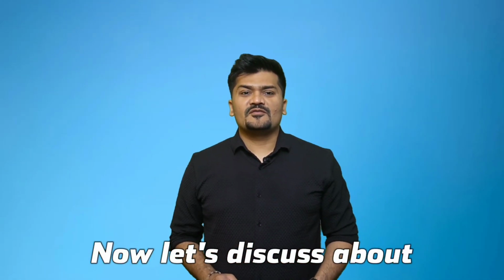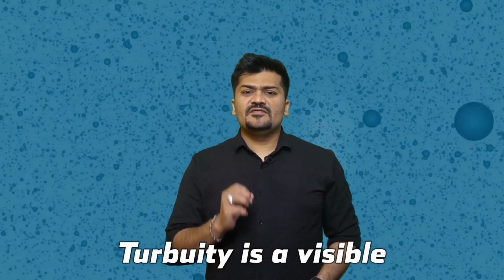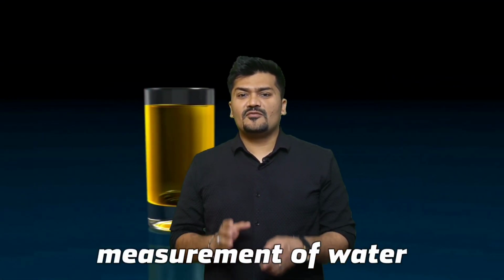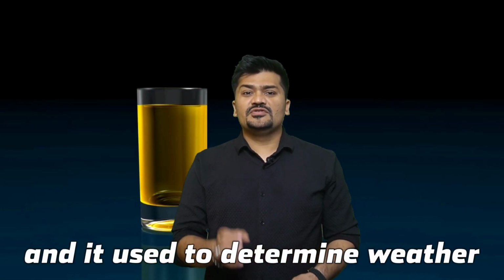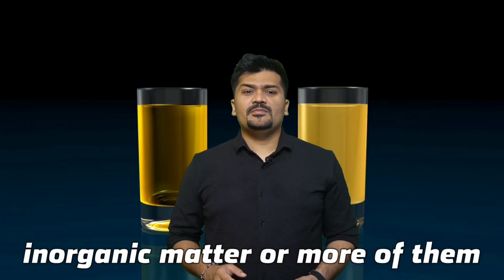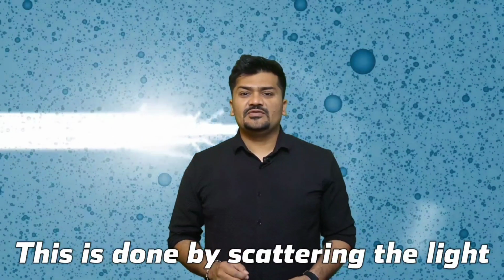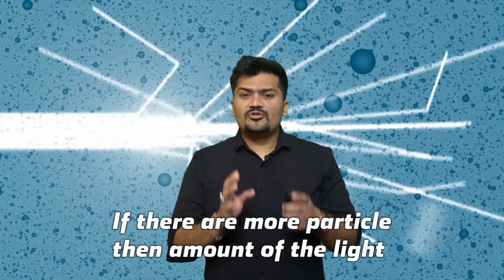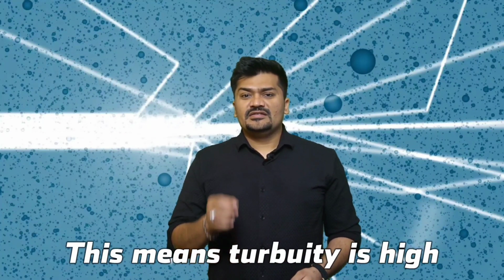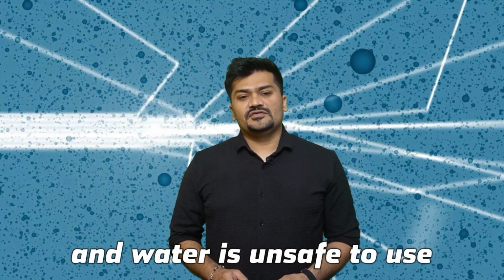Now let's discuss the fourth sensor. What is turbidity sensor? Turbidity is a visible characteristic of water. It is an optical measurement of water, and it is used to determine whether water has less organic and inorganic matter or more of them. This is done by scattering the light through the water. If there are more particles, then the amount of the light reflected will be high. This means turbidity is high and that water is unsafe to use.